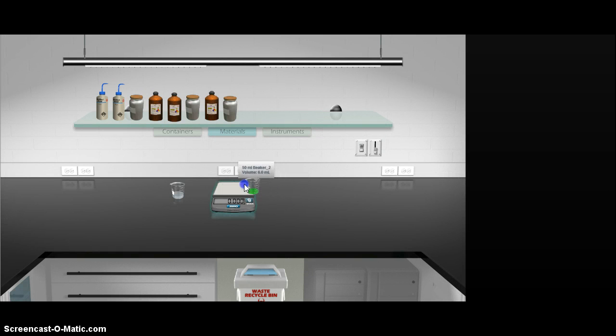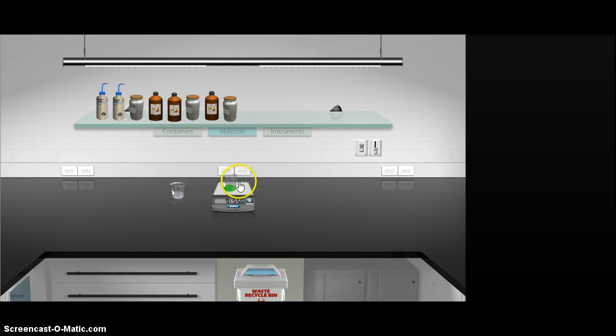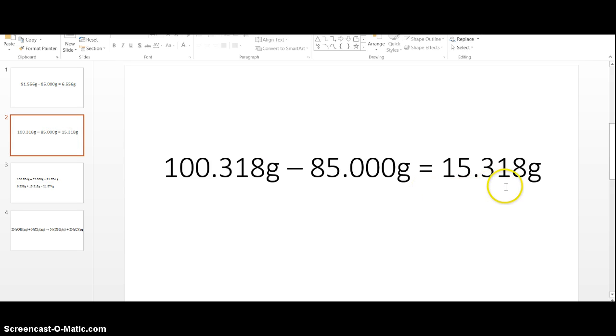As you can see, the mass is 91.556 grams for nickel(II) chloride and beaker, which, after subtracting out the mass of the beaker, leaves the mass of the nickel(II) chloride to be 6.556 grams. And the sodium hydroxide with the beaker has a mass of 100.318 grams. And again, after subtracting out the mass of the beaker, leaves the mass of the sodium hydroxide to be 15.318 grams.